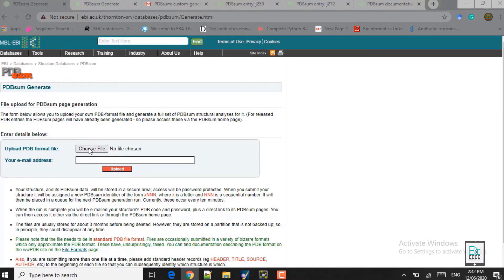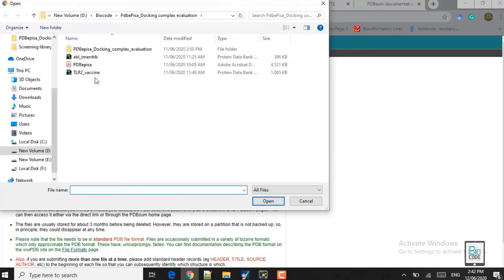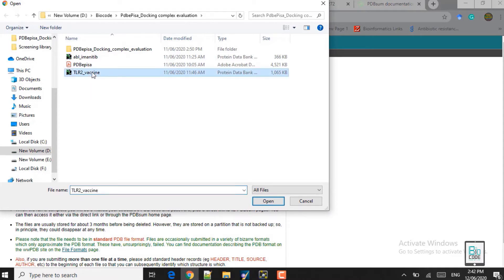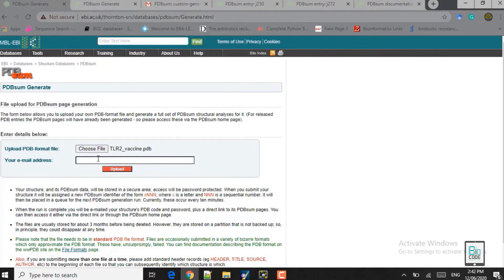In 'Choose File' I will upload first the protein-protein docking complex. In this complex, the receptor is a Toll-like receptor 2 and the ligand is the vaccine protein that I have generated in my previous studies. I want to evaluate which residues of the ligand protein are interacting with which residues of the Toll-like receptor protein. I will load the file to PDBsum, click on open, and here you can see the file is loaded.